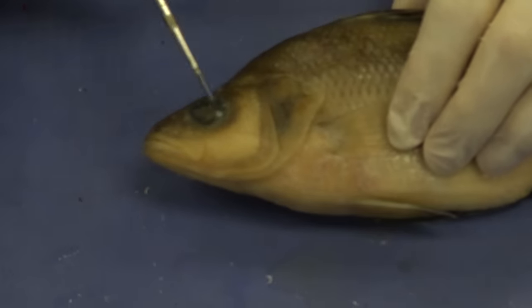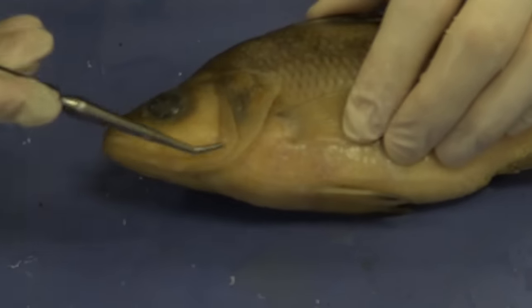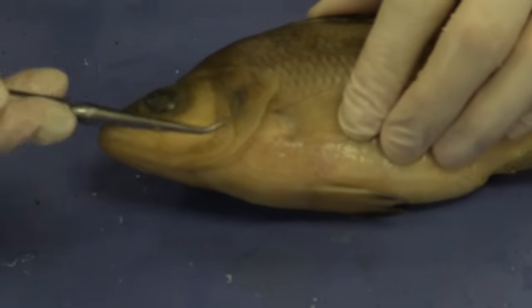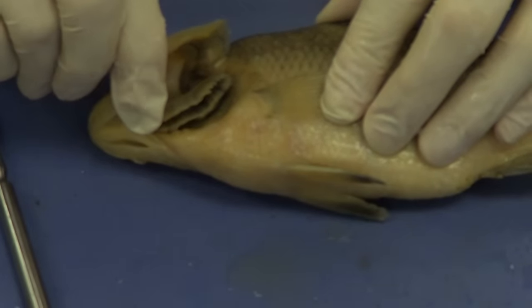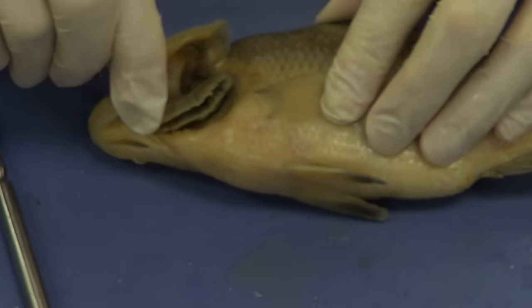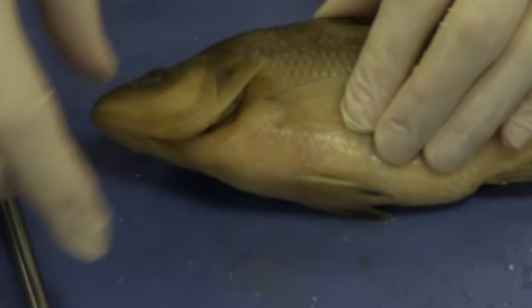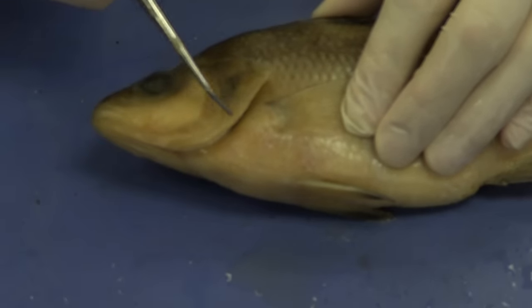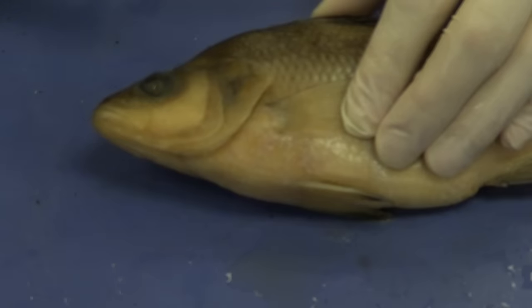If we go more posterior, we see this bony covering right here. I'm going to get my finger under there and pull that back — and you can see the gills. Those are all gills under here. This bony covering is called the operculum, and its job is simply to protect those very delicate gills.